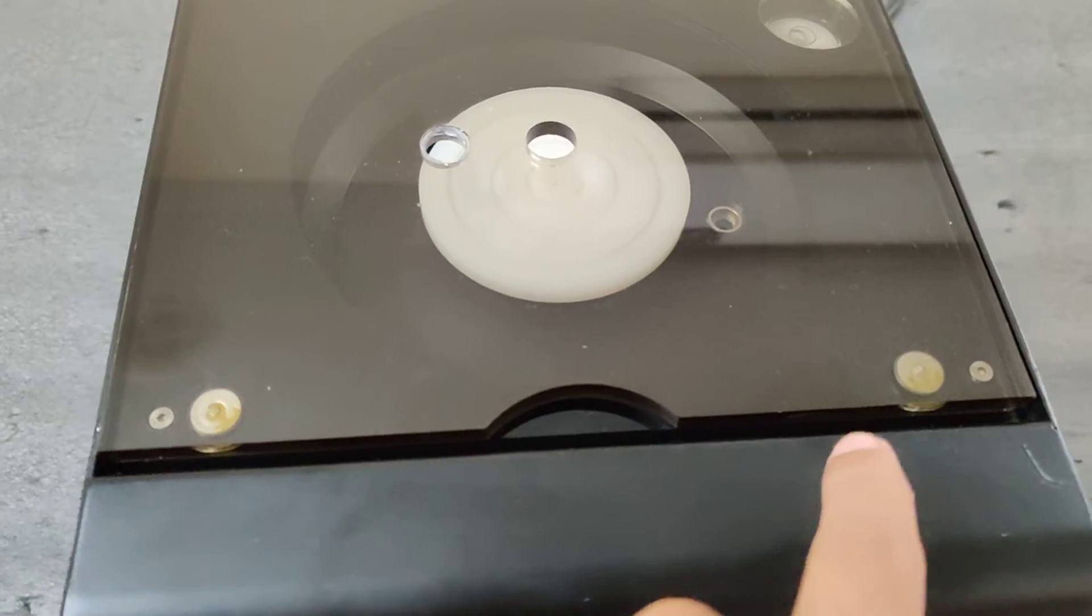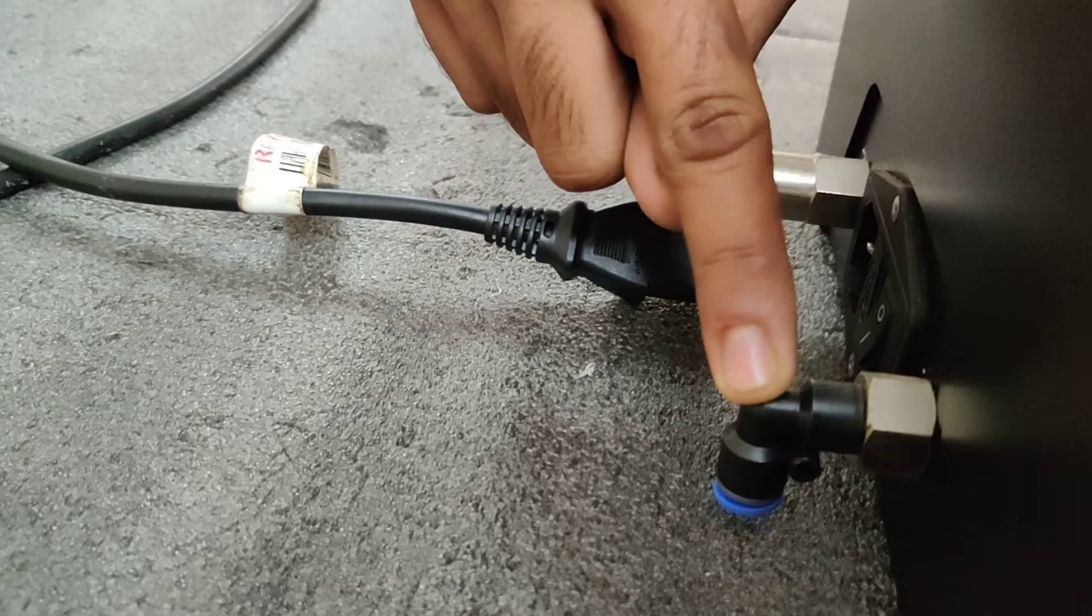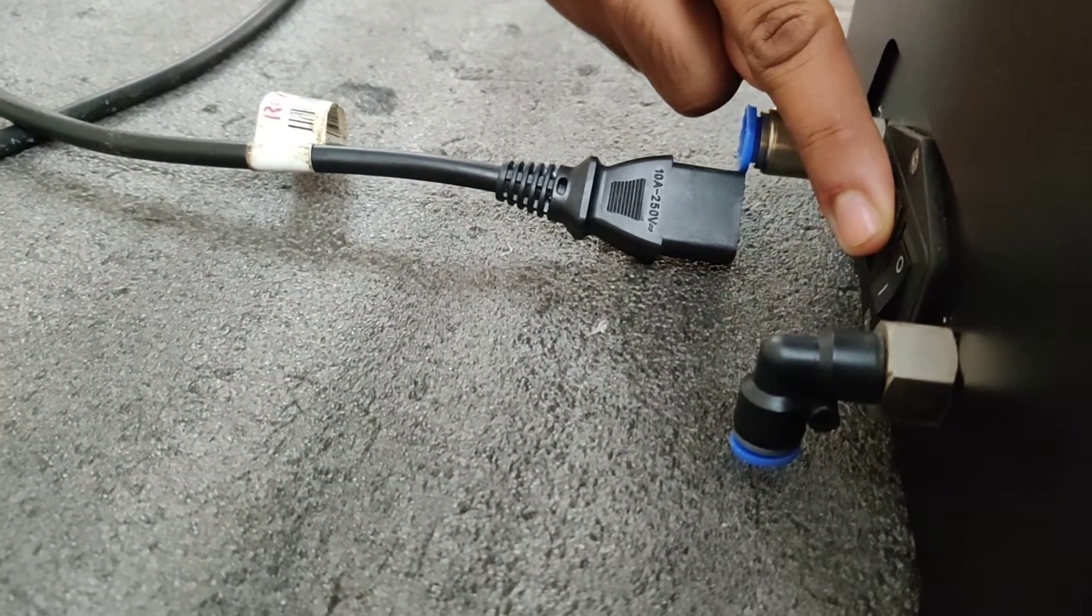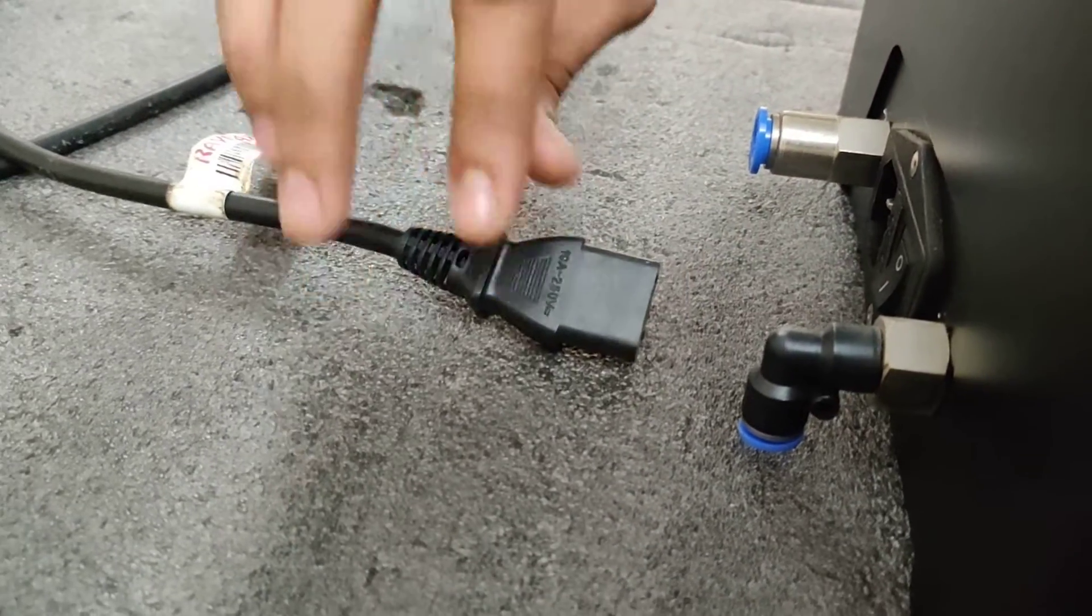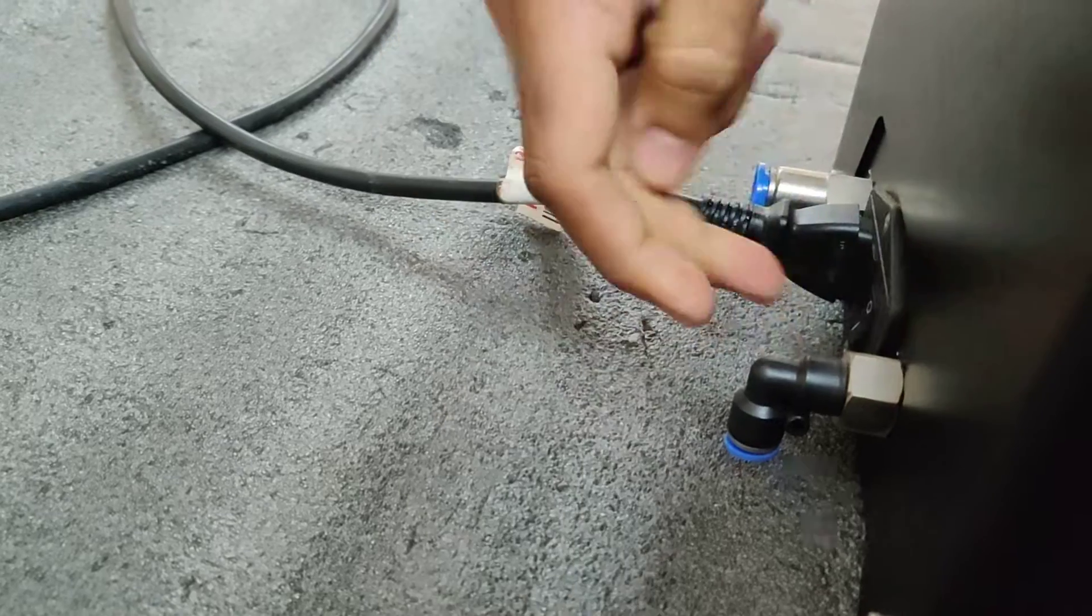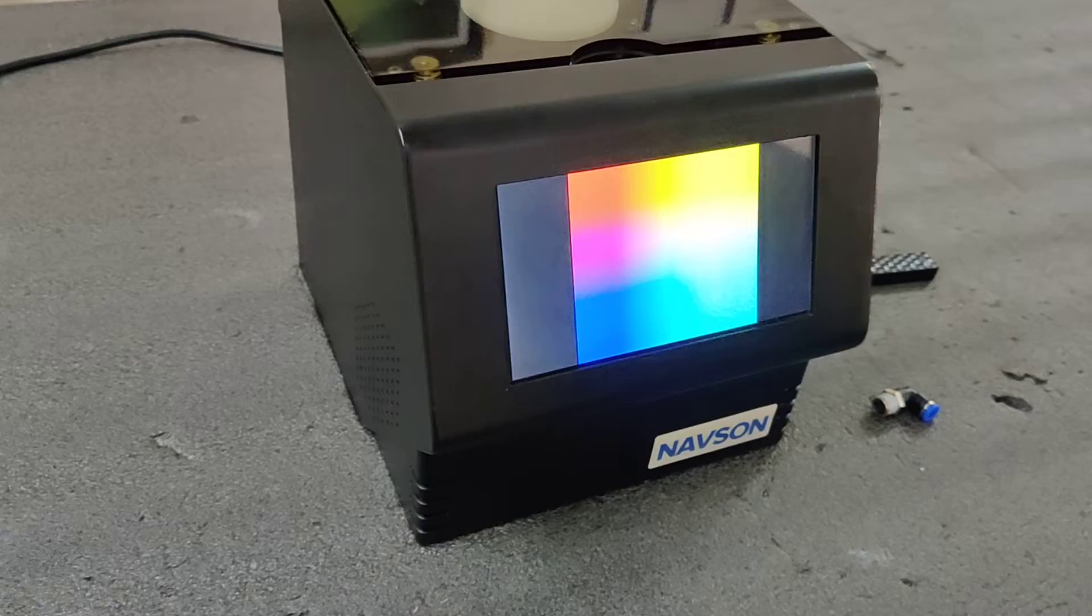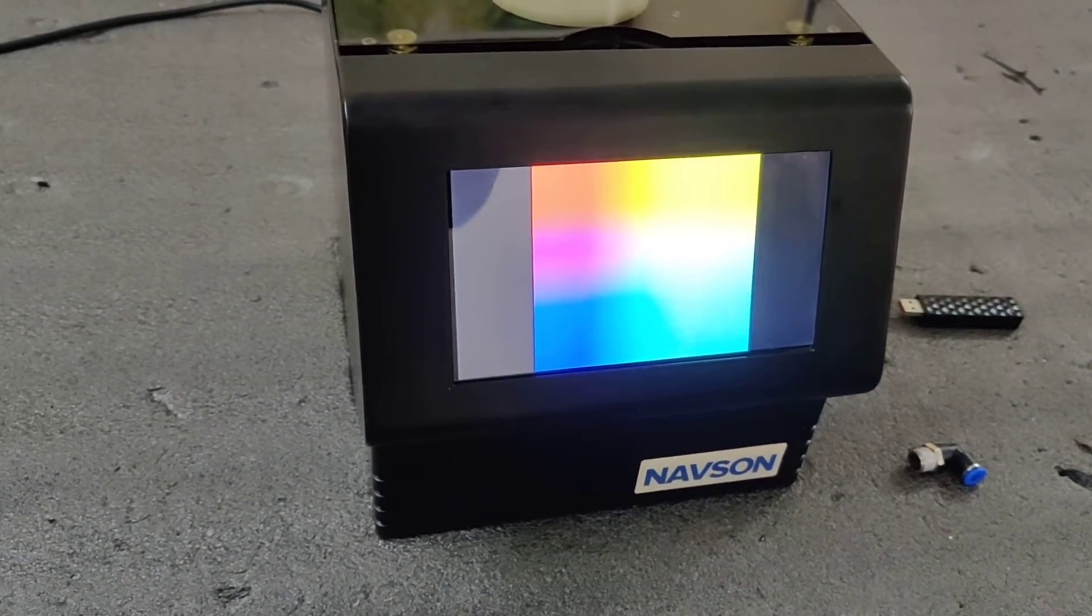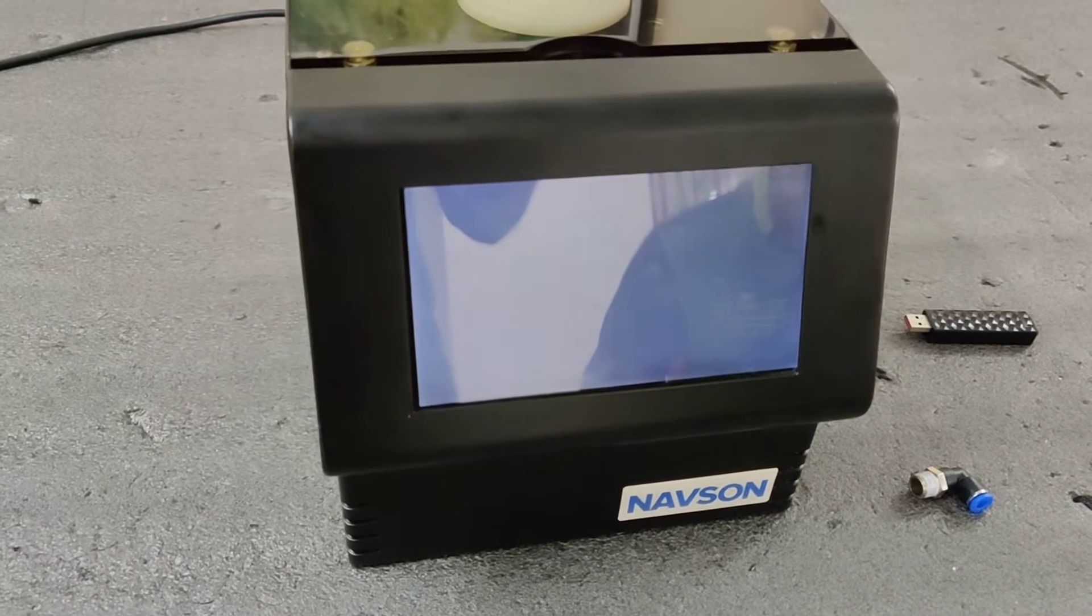Magnet locks. So this is the drain port, this is the power cord, this is the vacuum port. Now we will plug the instrument and we will switch it on. So this is the seven inch touch display that we will be getting along with the NT12000 spin coater.